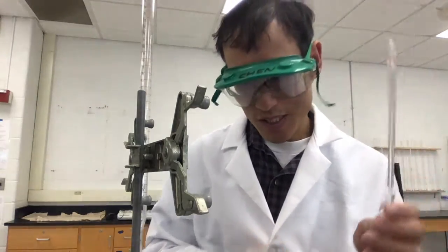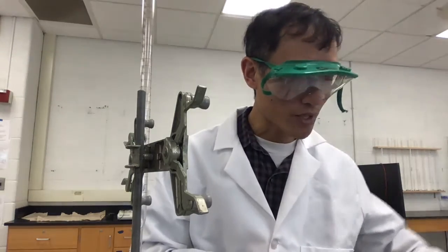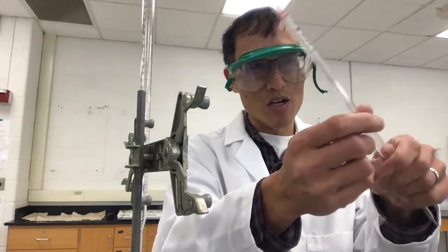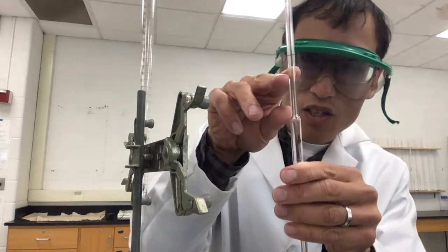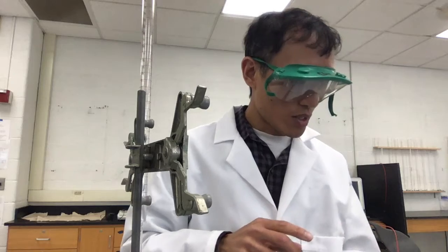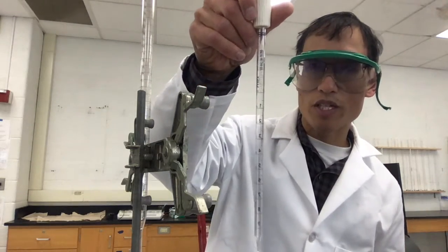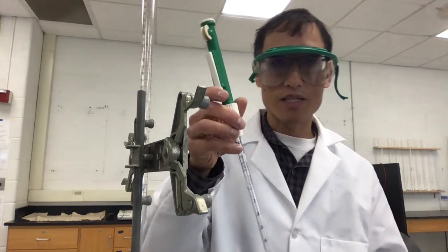That's not enough for this titration. I couldn't find any bigger volumetric pipettes around right now, so I'm going to use a graduated pipette. But in simulation, just know that when you draw this up, you kind of swish it around, you rinse it out, you draw it up, and then you get right to that line. You look eye level, and you see that that's at that place. So we're going to take, instead, a graduated pipette. This one's got graduations on it, and it's got little markings. And we're going to take 10 milliliters.